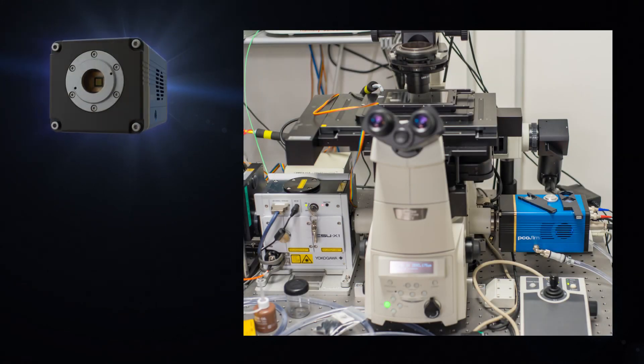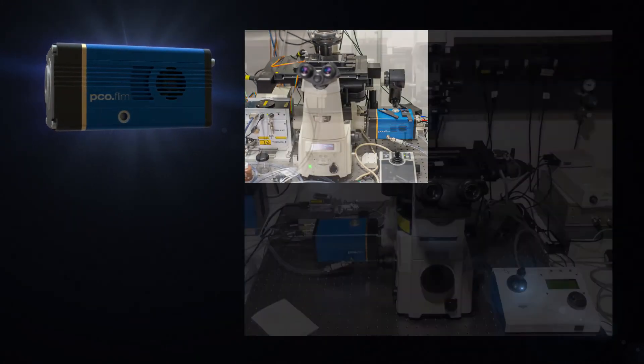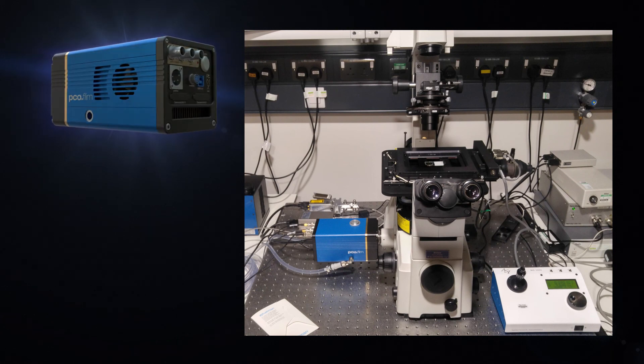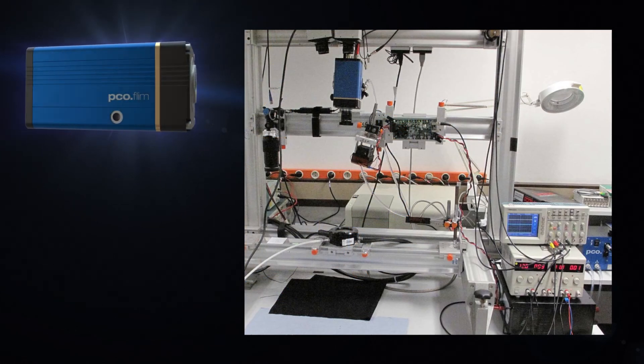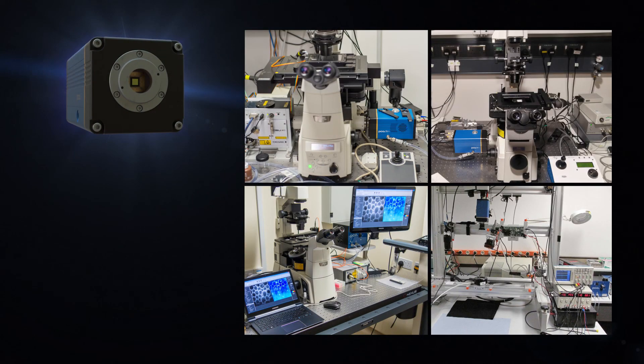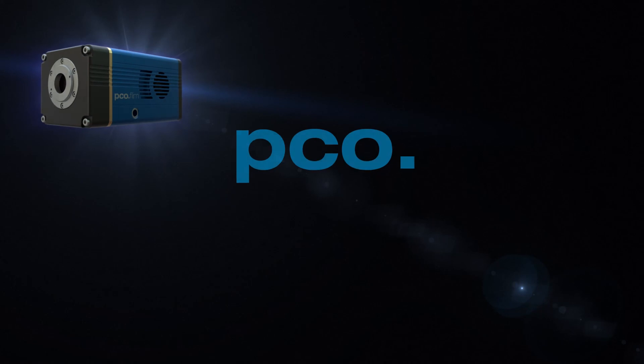PCO FLIM is the perfect FLIM system for fluorescence lifetime imaging, FRET measurements, dynamic life cell experiments, optical chemical measurements like optical oxygen measurements and more.